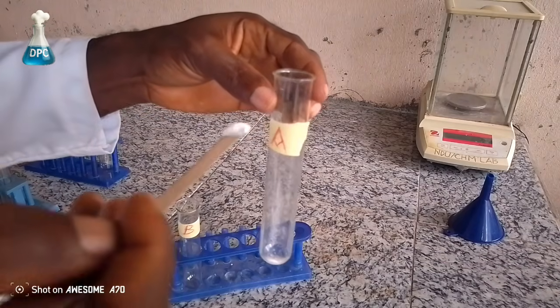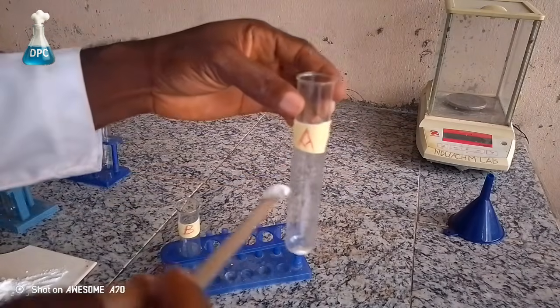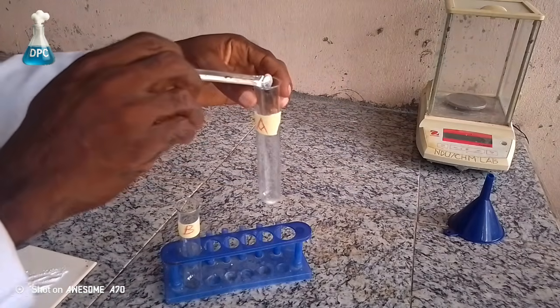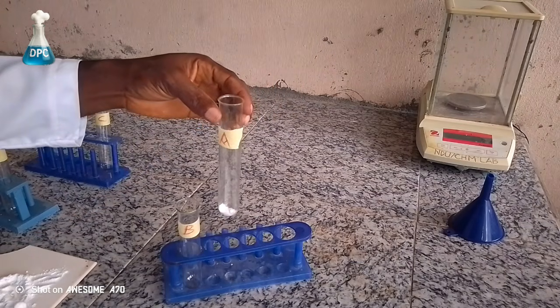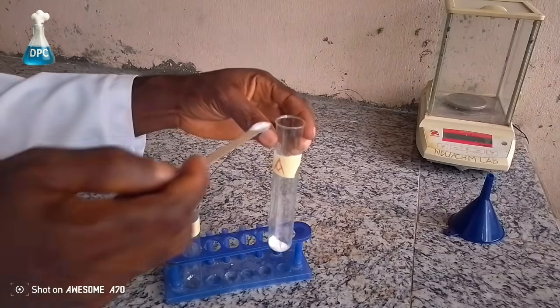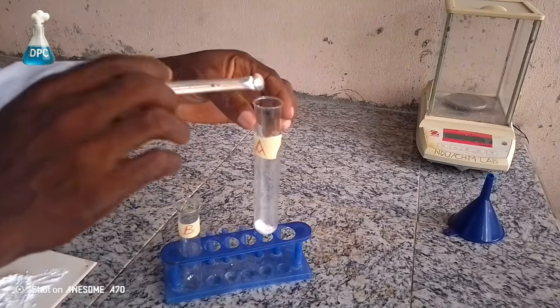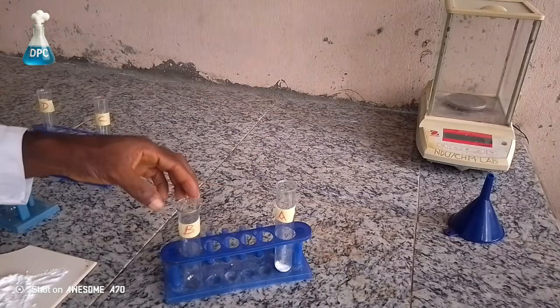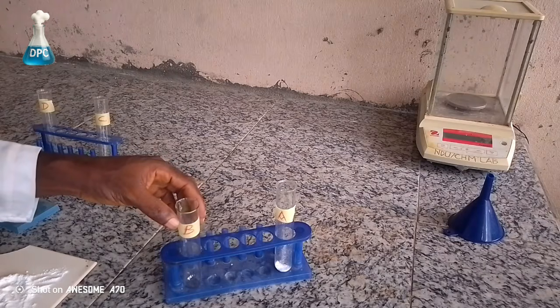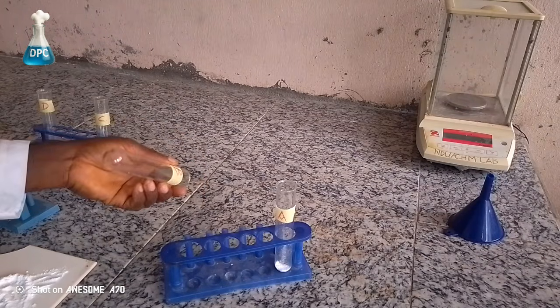Observe carefully. If you excessively load the spatula, then you have a tough time to make solution with it when you want to dissolve it, because it will form a saturated solution where you will not be able to dissolve all the sodium hydrogen carbonate in the 10 ml water that will be added into it. So you have to load the spatula to a kind of water level.